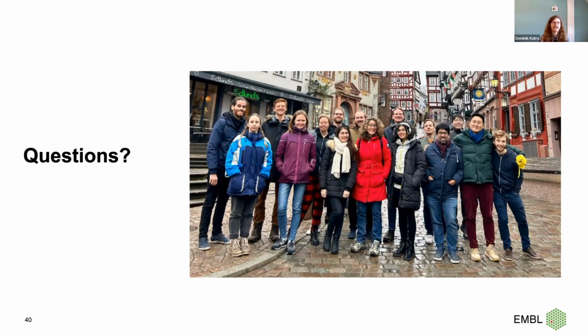So right now the advice would be to try it out, because this is where our energy has gone so far, to make it easy to try out so you at least get a quick answer. I've also seen it not work in some instances, or not work at all. In the future, we of course hope that we can find better tools for this, maybe automatically finding the best network that is out there.